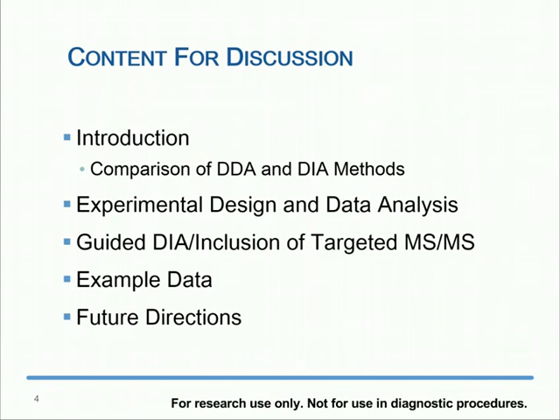So the content for today's discussion will be introduction, and we'll start mainly with the comparison of data-dependent or DDA acquisition and data-independent acquisition methods, experimental design and then data analysis for the projects that we're talking about during this section, guided DIA or inclusion of targeted MSMS to make specific measurements that are key to the biological question of interest, example data for a few of these measurements, and discussion of future directions.